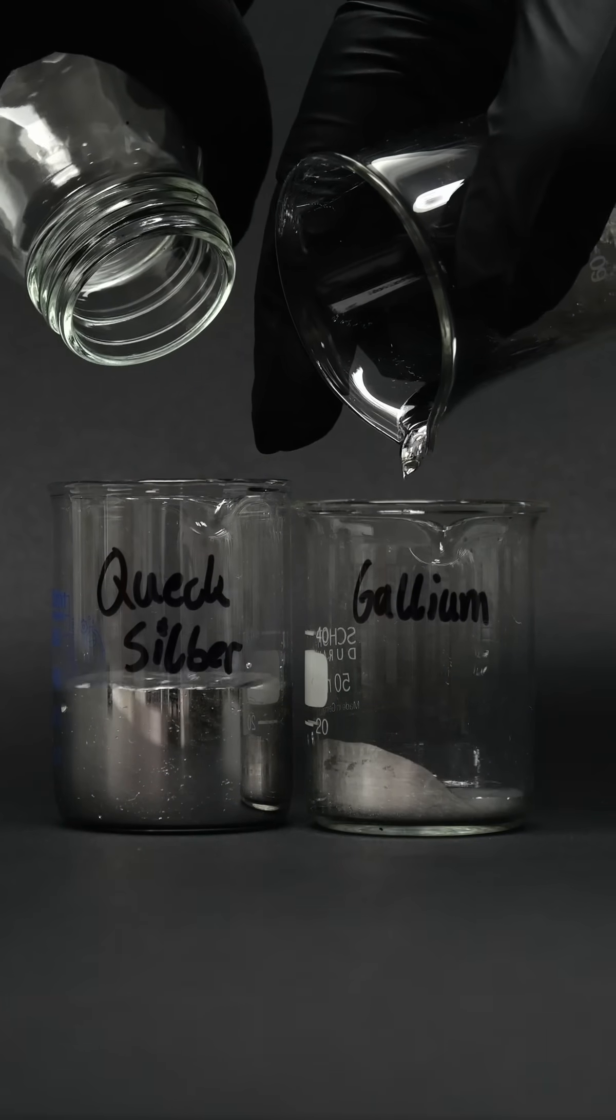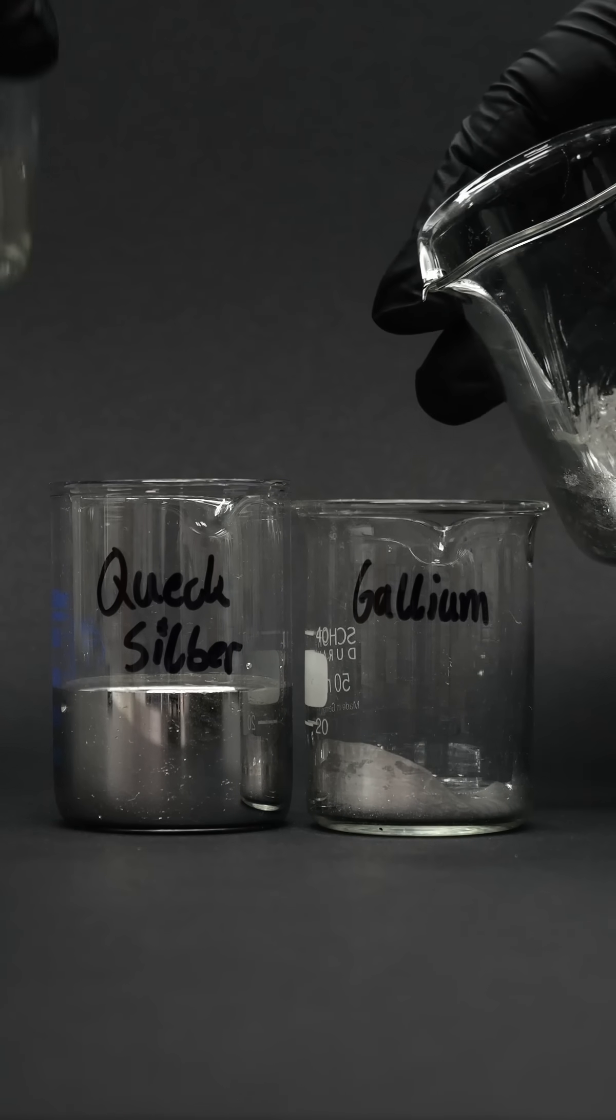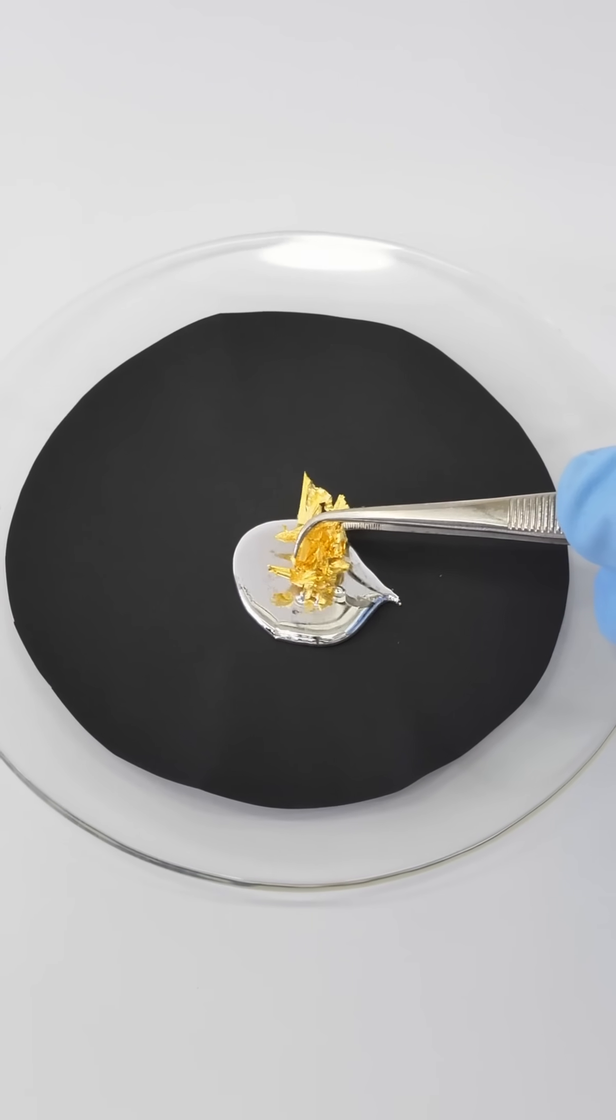Today I'm going to mix liquid mercury and liquid gallium together. Both of these metals possess the unique ability to form compounds with other metals.